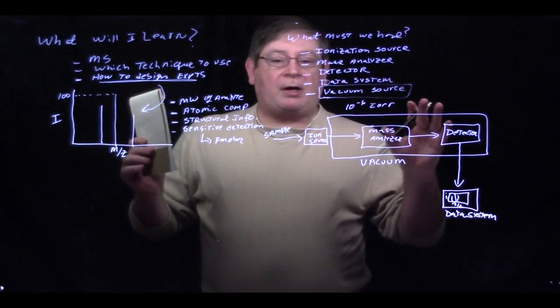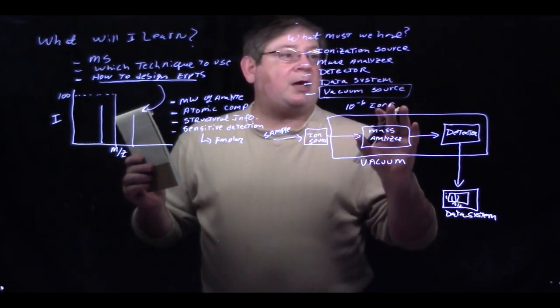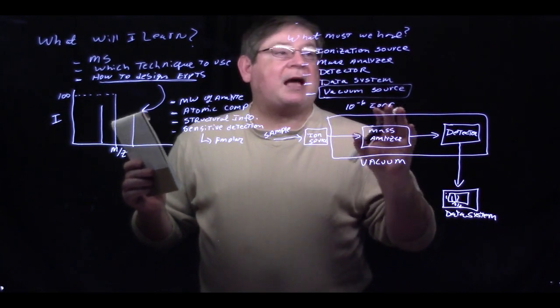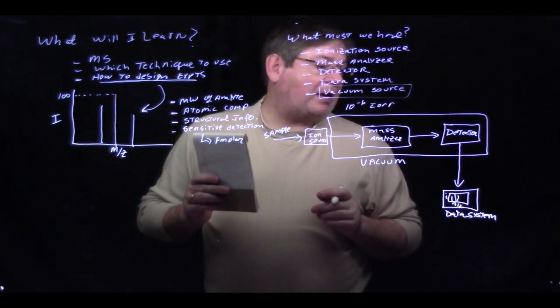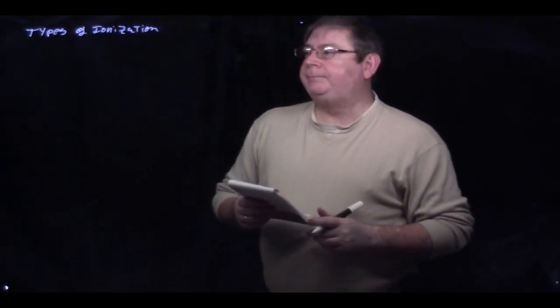So give me just a moment. I'm going to erase this and we'll finish up with some of the types of ionization that we have available to us here at the University of Southern Mississippi. So let's look at our types of ionization and what are some of the benefits of each type.